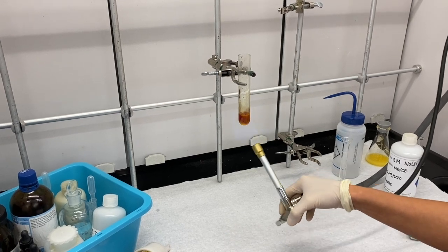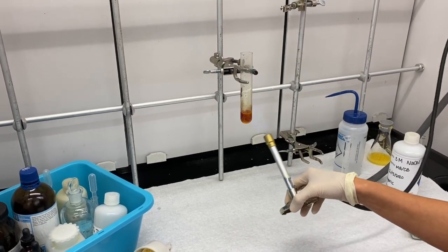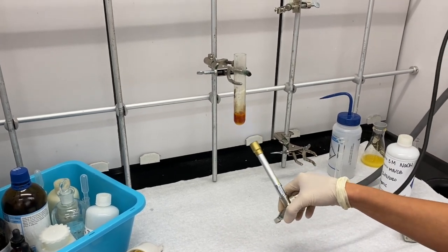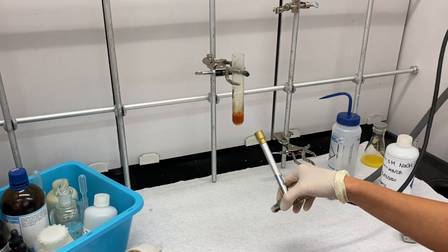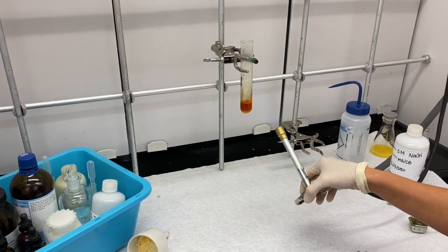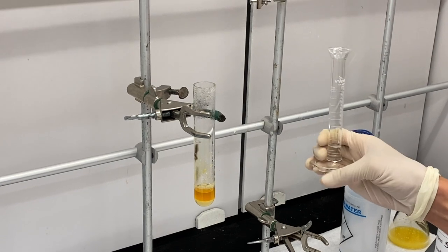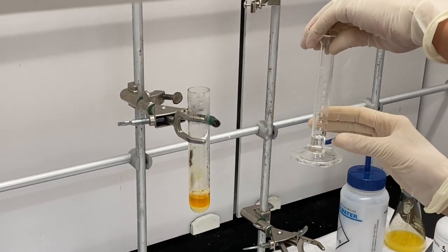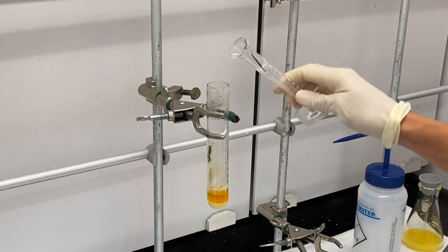Now we're going to heat this to boiling for five minutes and then let it cool back down. Add 2 mLs of acetic acid and then let it cool to room temperature. We'll cut away — we heat this to boiling for five minutes, now we have to add 2 mLs of acetic acid, and we'll let this cool to room temperature.